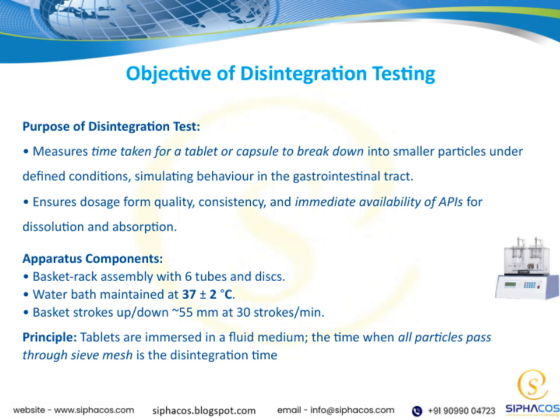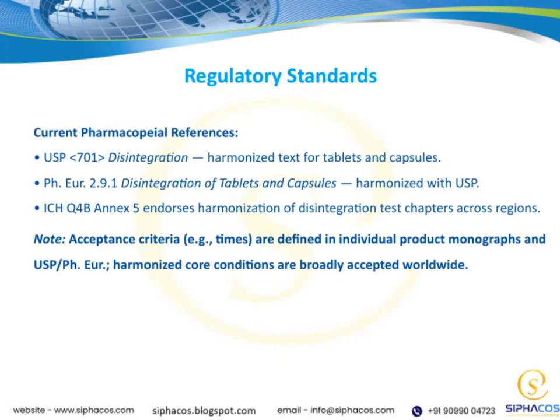The principle behind this test is fairly straightforward. We immerse the tablets or capsules in a fluid medium, usually water or a simulated gastric fluid, and observe the time it takes until all particles pass through a sieve mesh. That moment marks the disintegration time, which is a critical parameter in assessing the performance of the dosage form. By understanding this process, we can ensure that the medication will disintegrate properly and release the active ingredients effectively once administered.